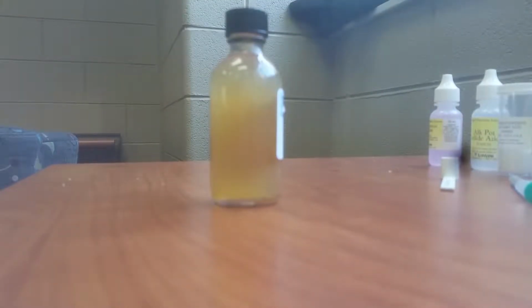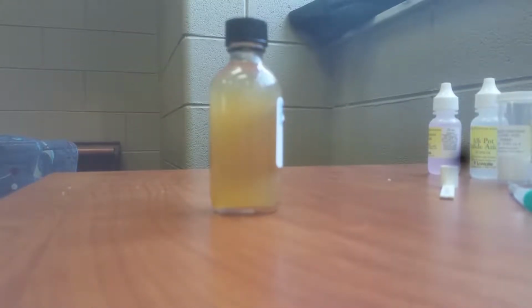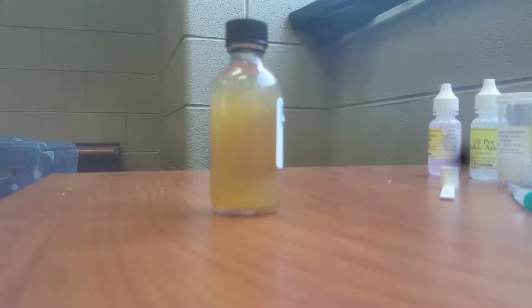We will now allow the precipitate to settle. This will take 5 minutes. As you see, the precipitate is forming around the shoulders.